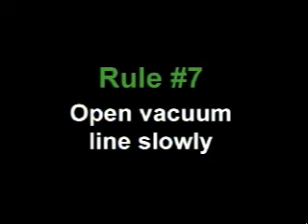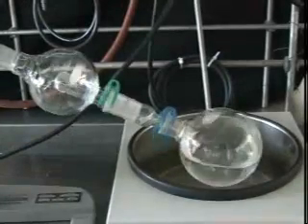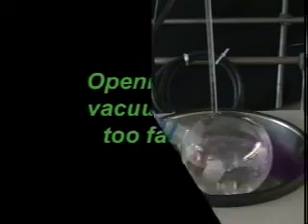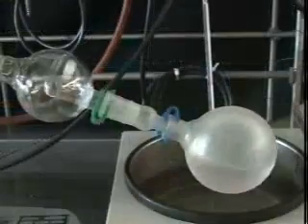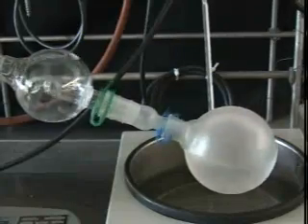Rule number seven, open the vacuum line slowly to start the evaporation. Watch your flask carefully to make sure that the bubbling is under control, and reduce the vacuum if it looks like it is going too fast. Opening the vacuum line too fast is another good way to get your material to bump. When you have achieved a stable rate of evaporation, lower the flask into the hot water bath. This will prevent the flask from icing up as it cools during evaporation, and it will help the concentration to proceed at a reasonable rate.